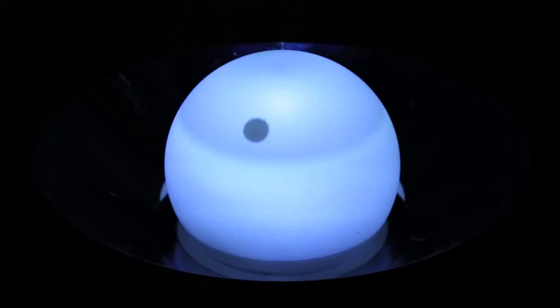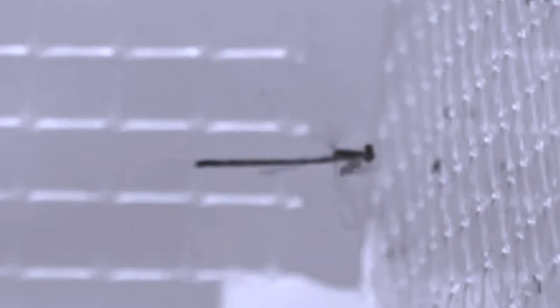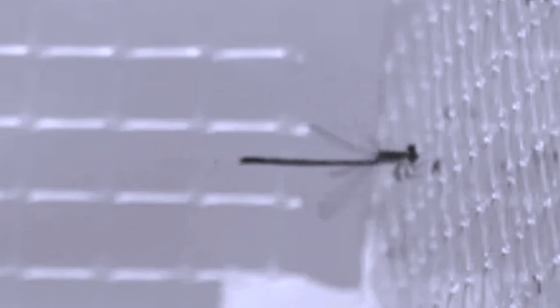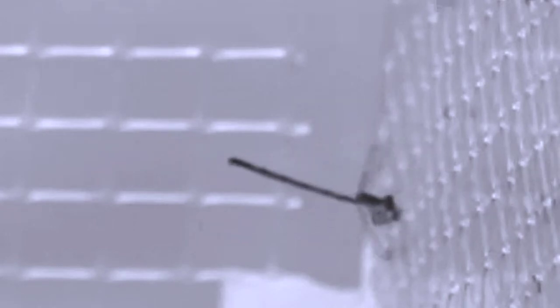The fly is standing in the middle of a domed screen, kind of like an IMAX for the fly. It sees a dark circle expanding rapidly, which mimics exactly the time course of a damsel fly darting in to grab it.